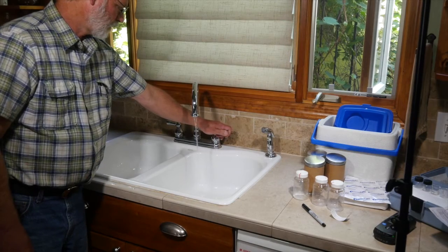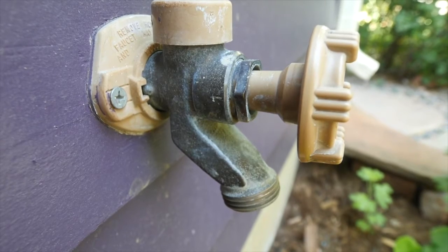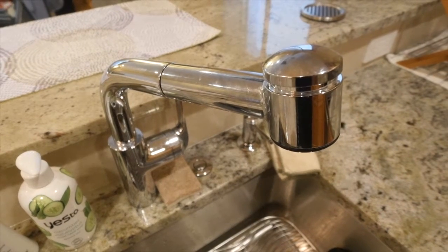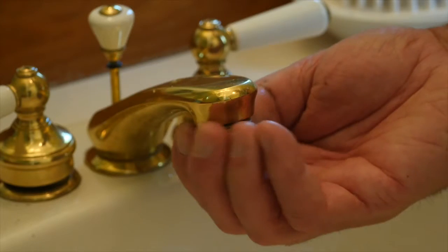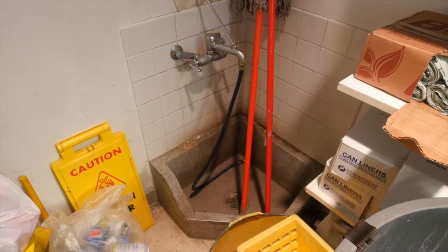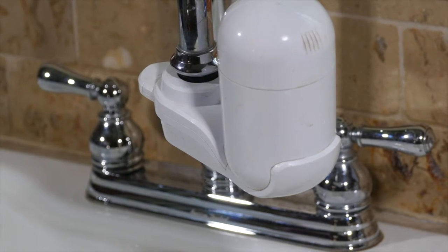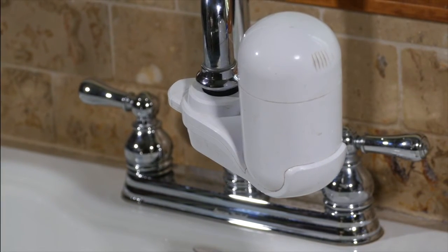Sample indoors when possible. Some sample taps are not ideal. If possible, avoid sampling taps that are outdoors, that have faucets with swivel necks, or that have single valves for both hot and cold water. You should also avoid samples from leaky faucets or leaky pipes. Avoid faucets that are threaded on the interior. Upward facing faucets, such as drinking fountains, should also be avoided. Avoid faucets located in a room of questionable sanitary conditions. And don't take a sample from any site that has household point of entry or point of use devices, such as softeners or reverse osmosis.